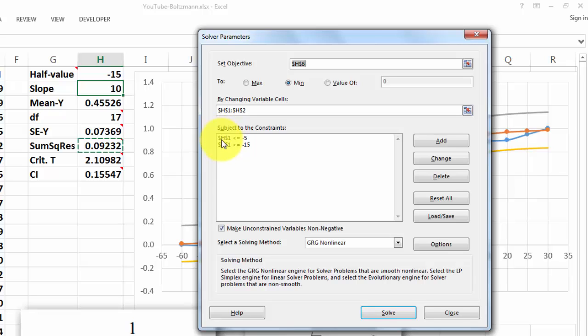That h1, the half value, should be less than or equal to minus 5 and greater than or equal to minus 15.